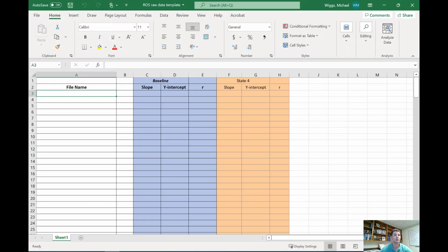So first let's jump to the template of what we're going to fill out. Note that these template folders, I usually try to put one of these files in with the data that you're going to be analyzing, so check the folder that I've given you to analyze. We really need only a handful of things. The first thing you should always start with is writing the complete file name of the data. Sometimes these can be long, depending on how they were saved, so you can copy and paste that from the folder, or you can just type it in.